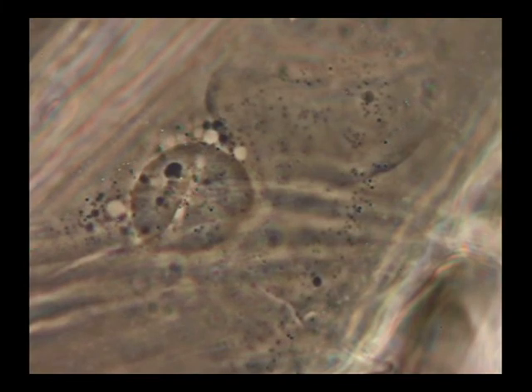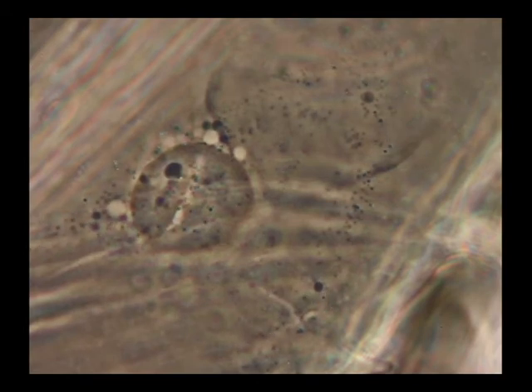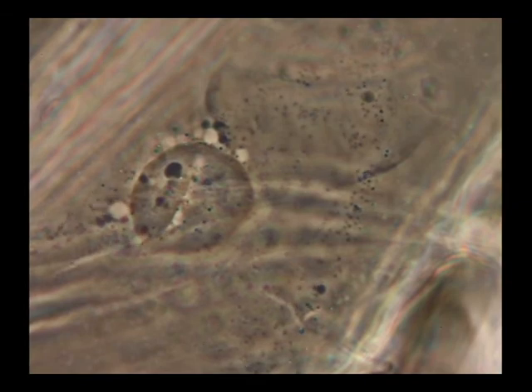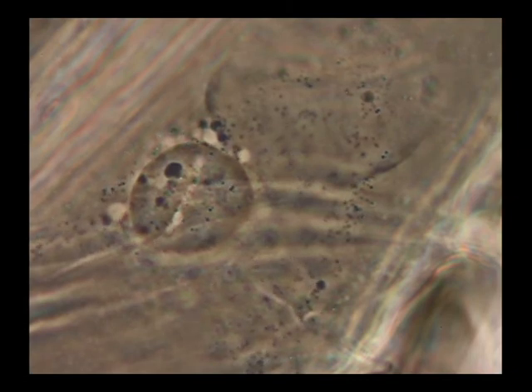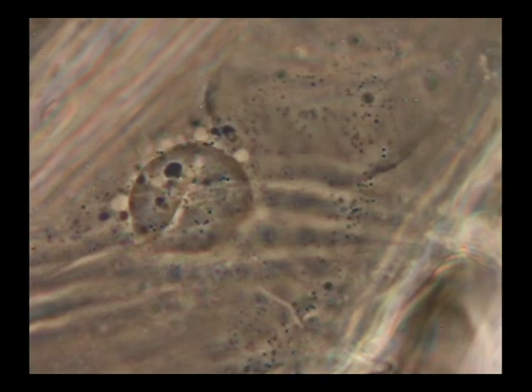Just to sidetrack this video a little bit right now, you can see the movement, and that's cytoplasmic streaming. You see these big molecules, and then you see those small little green ones, I think, that have been dyed, and those are what's actually moving along, kind of like a highway system, in order to get from point A to point B, to drop off any nutrients, organelles, any amount of substance in order to get the cell what it needs.